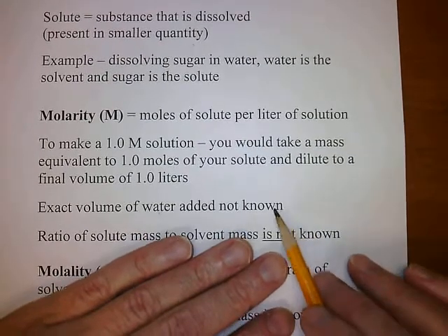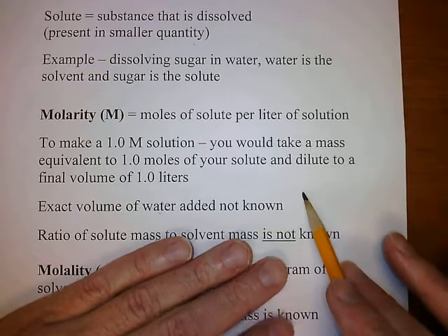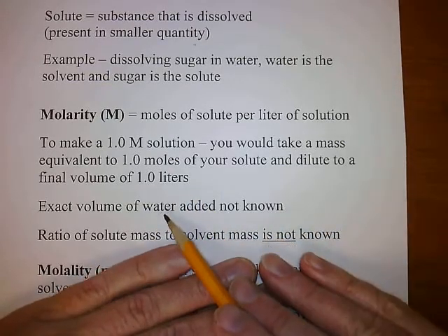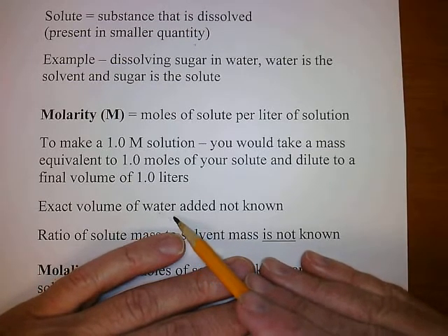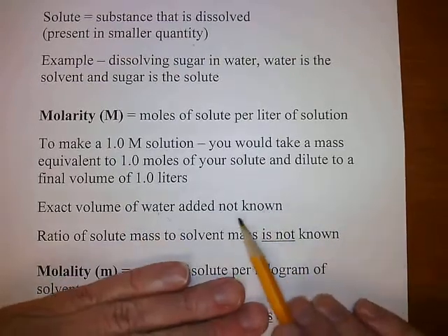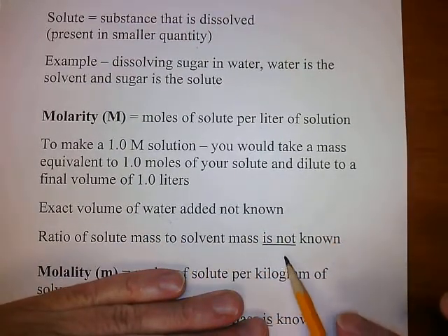It's a subtle but important point that the exact volume of water, or whatever solvent you're using, added is not known. You don't keep track of how much solvent you add. You're just adding enough solvent to make that liter of solution. So the ratio of solute mass to solvent mass is not known.